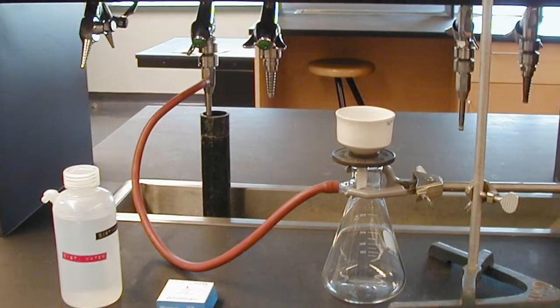Then we proceeded to remove any excess solid precipitate from the beaker through vacuum filtration. It's a very simple method. You take a filter flask and attach a vacuum tube to it, and you pour everything through a Buchner funnel, and the vacuum forces the solution through a filter.